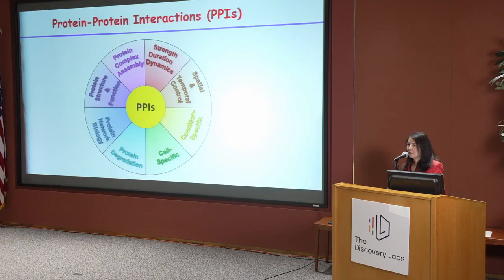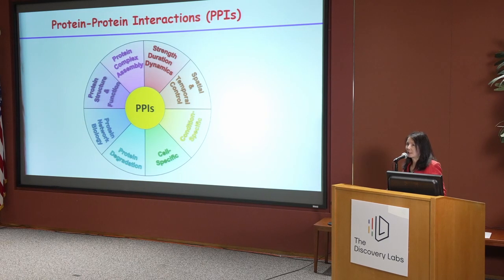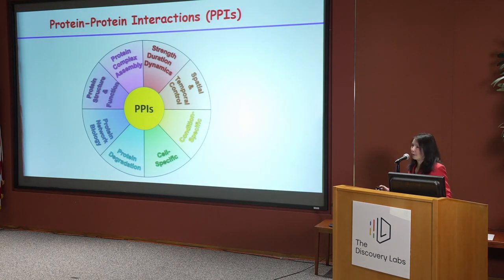From all the previous speakers' talks, you already see all the great examples of how important protein-protein interactions are. I just want to emphasize that protein-protein interactions are fundamental to protein complex formation, and also essential to the understanding of protein structure and function, as well as protein network biology, which are important to understand the phenotypic responses of all different types of cells.